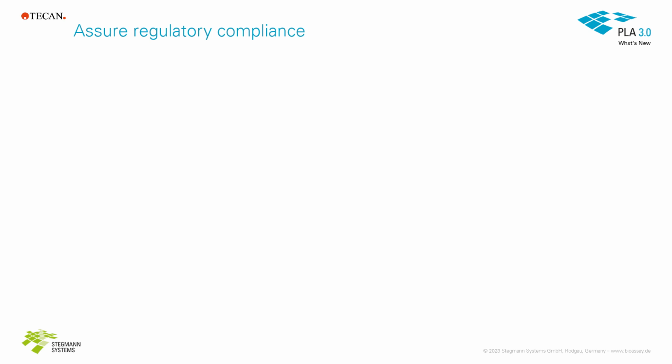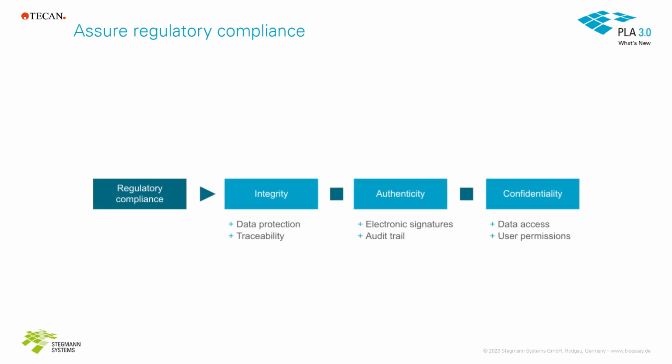Of course, PLA 3.0 also provides regulatory compliance. Every single bioMérieux endotoxin detection assay document is 21 CFR Part 11 and GAMP compliant to support the requirements for highly regulated environments. Integrity, authenticity, and confidentiality of electronic data in your system.